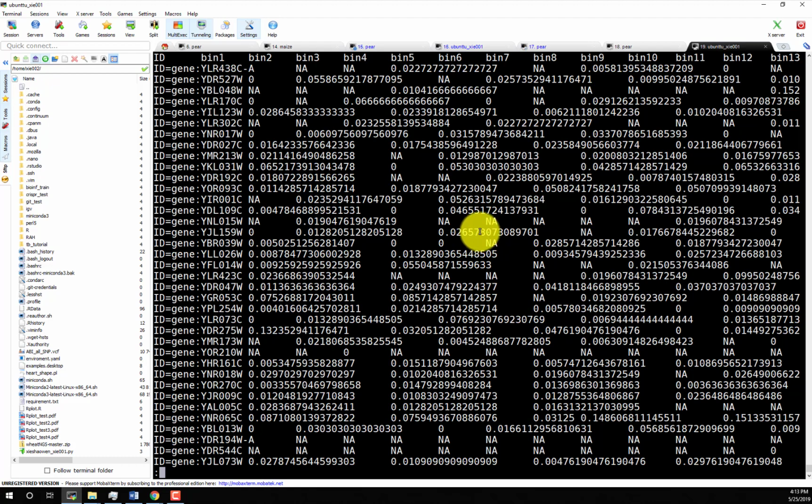I think the main difference between whole genome bisulfite sequencing and ChIP-seq, especially for this heatmap generation, is that ChIP-seq relies on the read density. So even if there's no read, it's fine. That means the read density is very low.